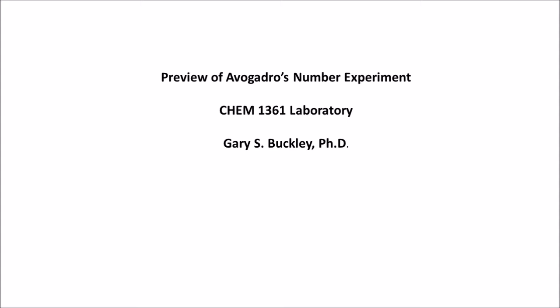This is Dr. Buckley. I thought I'd put together a short presentation for you about the upcoming experiment on Avogadro's number. And so I'm going to go through some things. You certainly have the lab book. You ought to read that. Take a look at it. Make sure you know what you're going to be up to on here. But as we go through here, we'll give you an idea of what things look like so you can get a feel of it, and hopefully you can work pretty efficiently in the laboratory.